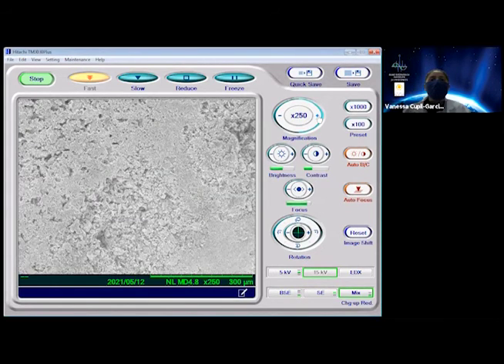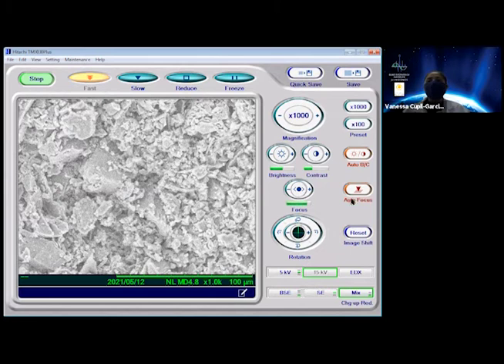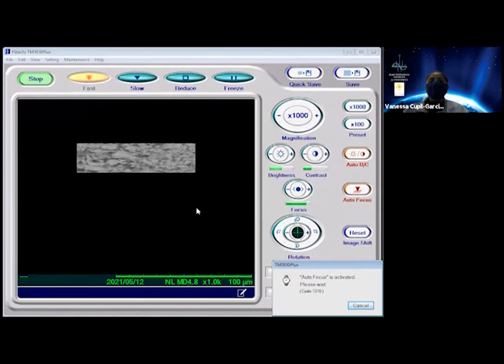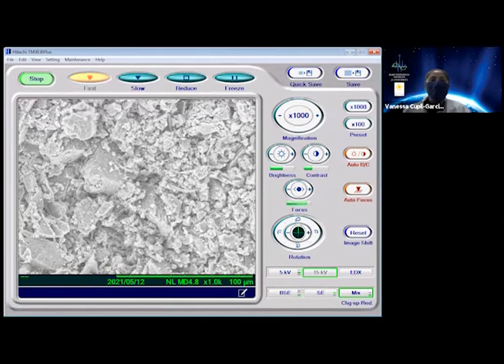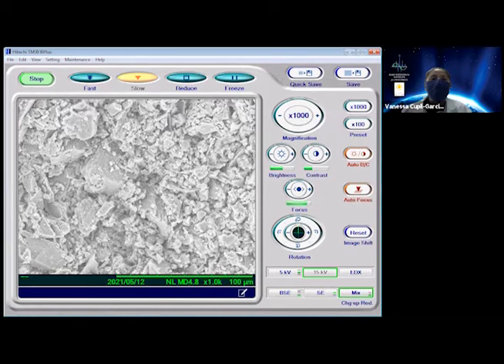So if we use our microscope to magnify much more. So right now we're 800 or even like a thousand times magnified, we can autofocus. And it's really nice that the instrument or machine and our microscope also autofocuses. So here we can see the paint pigments that are on this piece of wall or drywall. And we can see how they dried onto the sample. And they have this really cool structure where they're cubic and all these different shapes. They say that watching paint dry is really boring, but I really like looking at this paint picture. If you showed this to me out of the blue, I would not have been able to tell you that this was paint.